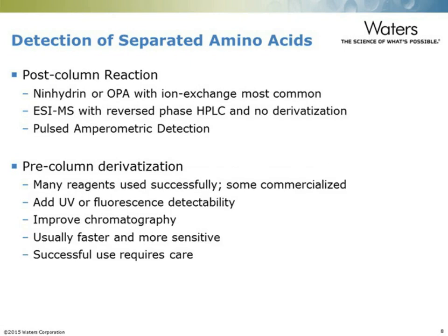Once the amino acids are separated, however, we still have to monitor the separation for purposes of detection and quantitation. And there are two basic approaches.